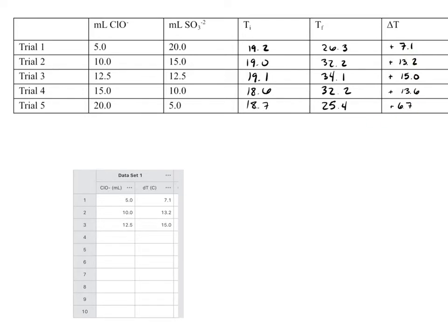And what I want to do now is open up the Vernier app and choose the bottom option that says manual entry. It'll basically open up a blank graph and a blank table for you to put data into. Now immediately, these two headings over in the upper right-hand corner where you put your data sets in are going to be just labeled X and Y.